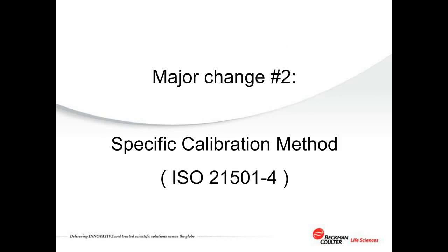Also, it references ISO 14644-1, and that calls for the need to make sure your instruments fit the ISO 21501-4 calibration. A lot of older instruments would not necessarily be able to be calibrated to that, and if an instrument is not in good repair, it might also fail this calibration method. So this keeps an eye on the health and performance of an instrument in a much more effective and efficient way than any generic calibration method that might be used.